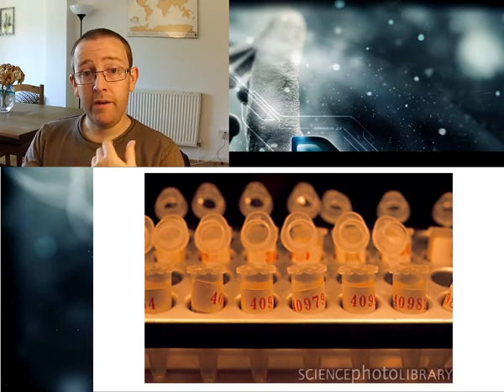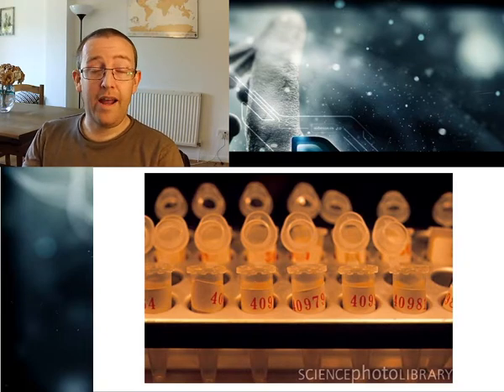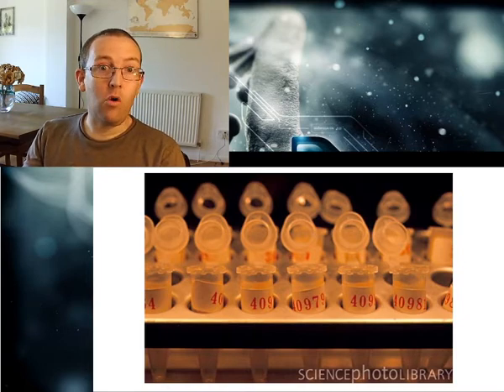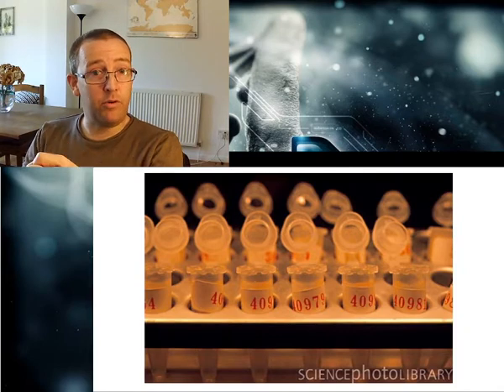Okay, now that obviously is a very short version. Right, if you look inside a heat cycler, inside the heat block while it's working, you would see something like this, where you've got tons and tons of tubes in one heat block being heated up, cooled down, heated up, cooled down. As I say, this equipment is so common, I have actually known university academics taking old heat cyclers and literally setting them to a nice even 70 degrees or so, and having them in their office to put their cup of tea on.